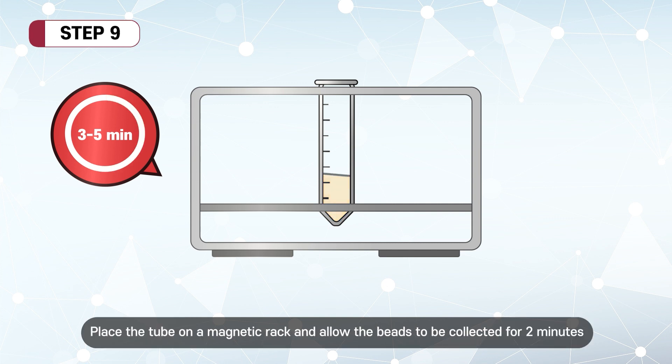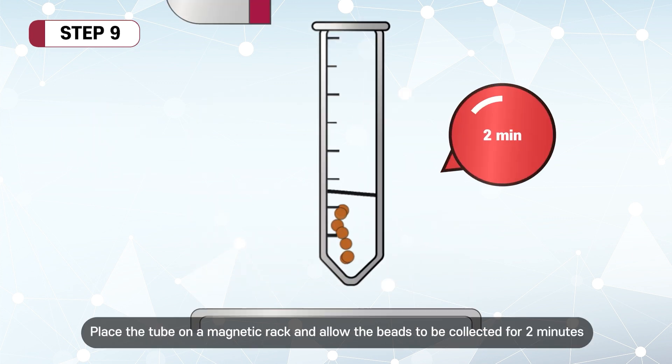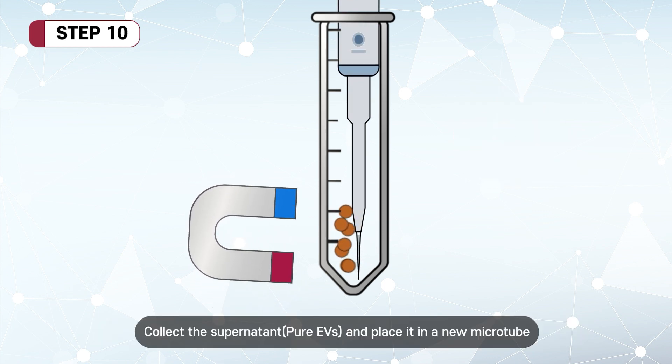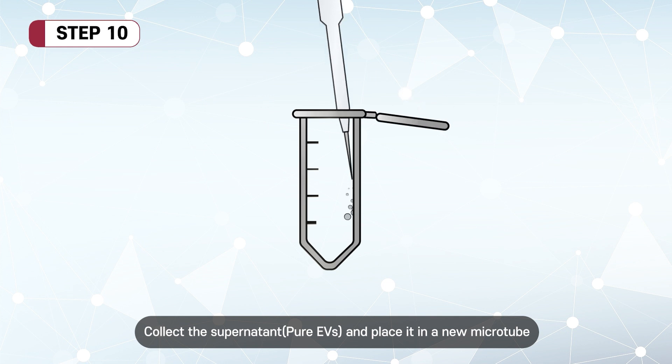Place the tube on a magnetic rack and allow the beads to be collected for 2 minutes. Collect the supernatant, pure EVs, and place it in a new microtube.